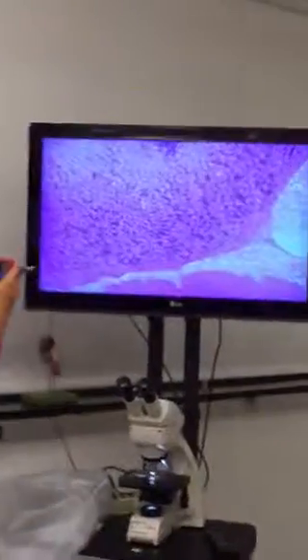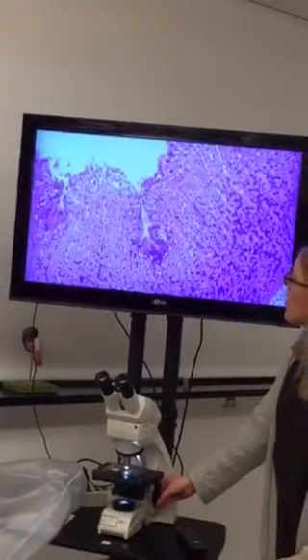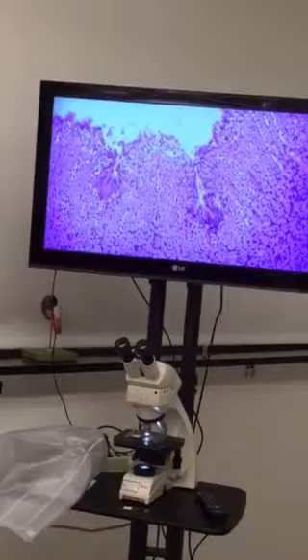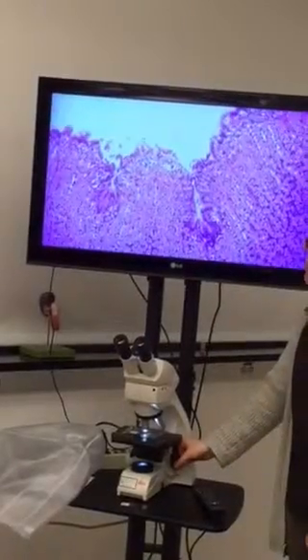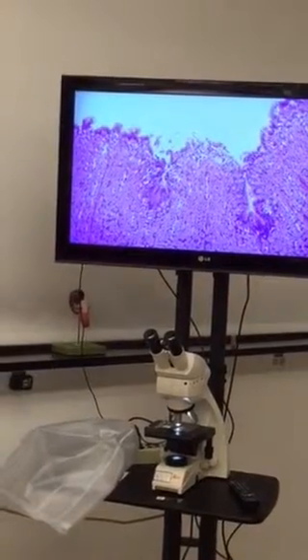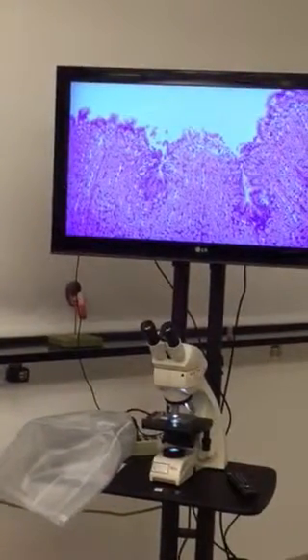If I ask for a gland, would it be gastric gland? It would be gastric gland. Yep, you got it. If I ask for the layer that's in the lamina propria, gastric gland. If I put the pointer on the simple columnar cells, you can just identify it as simple columnar. But if I ask what layer the simple columnar cells are in, that is the mucosa.